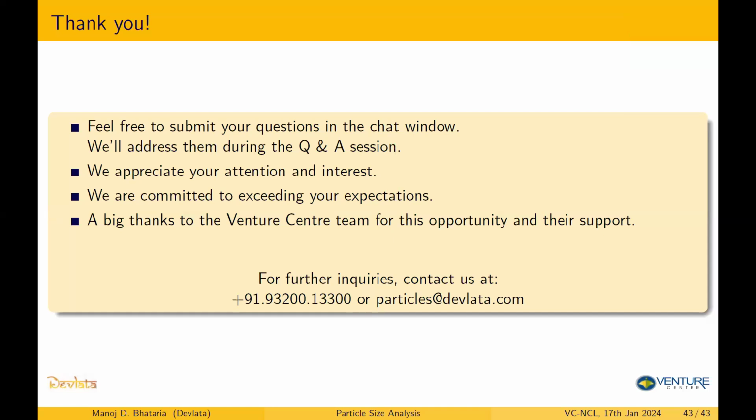It's always in comparison to some other technique. It is never an absolute measurement for a particular range. So it is nothing like, say, for 100 nanometer size distribution it is good or 200 nanometer it is good, and beyond that it is not good. Nothing like that. It is just in comparison to some other techniques.